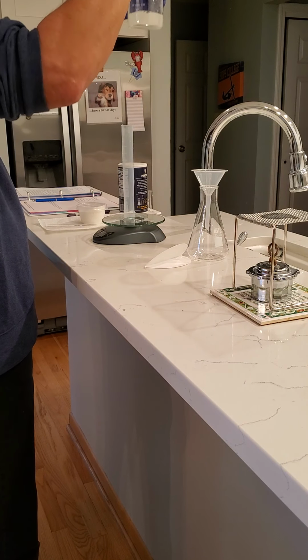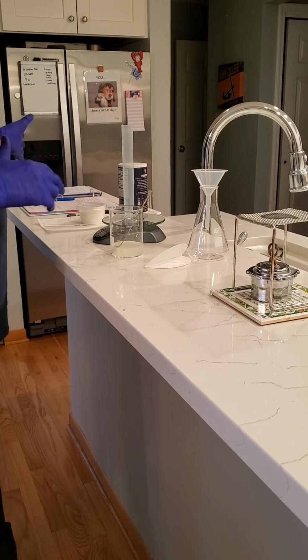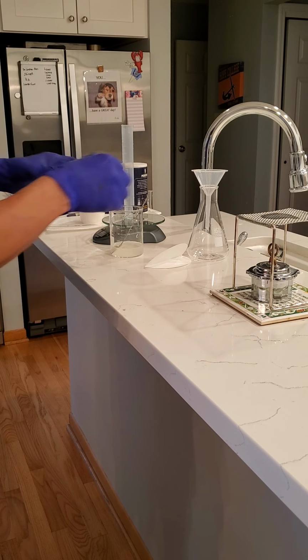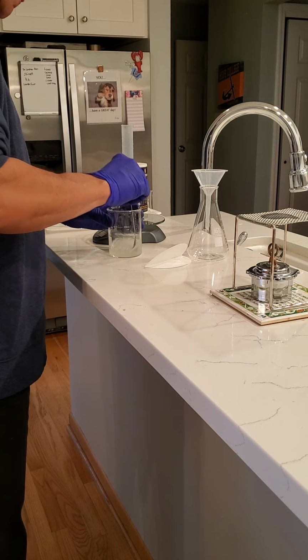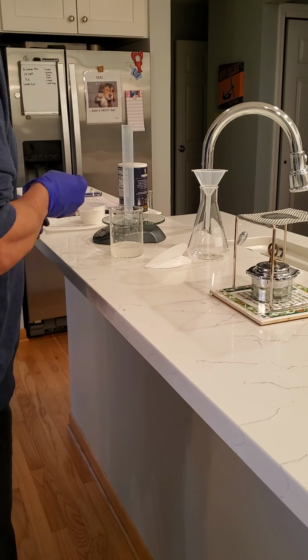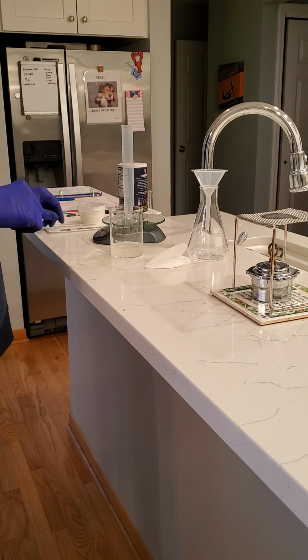We're just going to keep adding salt until it no longer dissolves in our 50 mils of water. The procedure says to use 100 mils of water. I'm just going to use 50 because eventually we're going to evaporate off the water from the salt and weigh that, and it'll take too much time to evaporate that much water off.